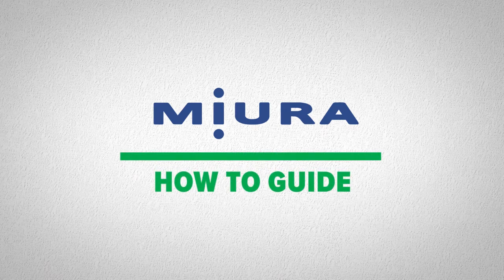Welcome to Miura's How-To Guide. In a moment, we will cover step-by-step instructions on how to collect a boiler water sample.